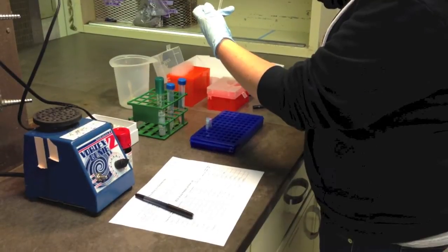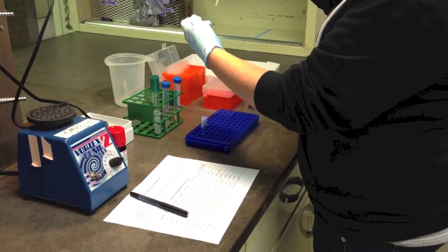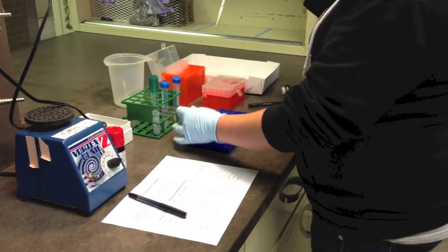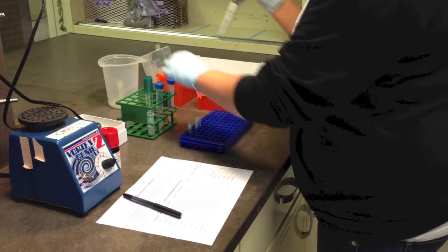Returning to our video, we now see our technician filling the tubes with the proper amount of liquid for archiving.